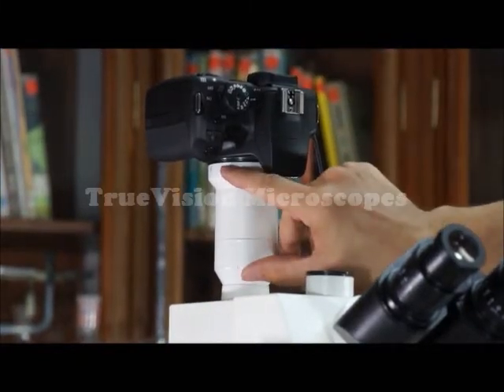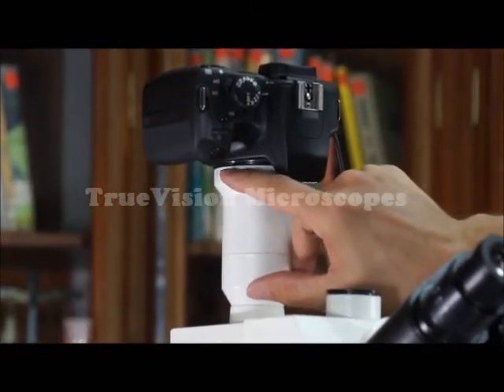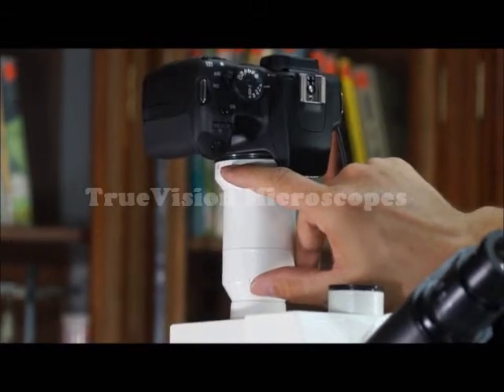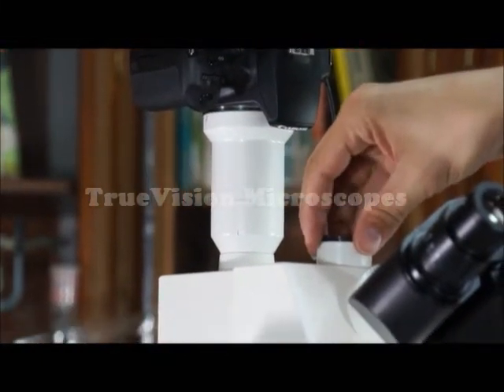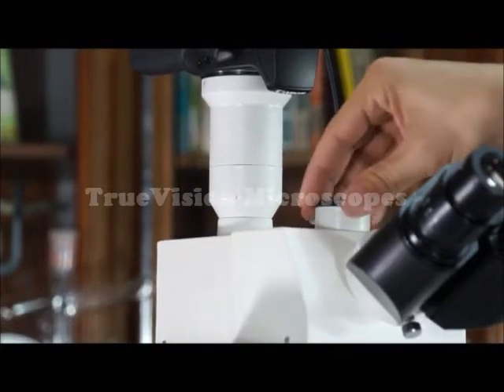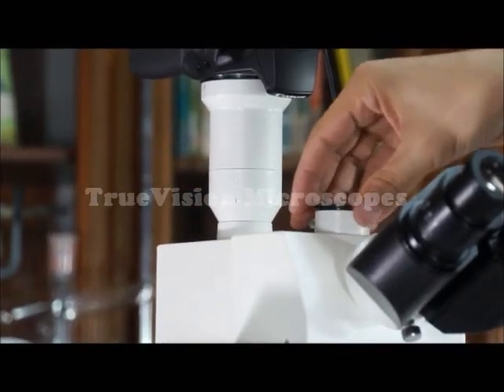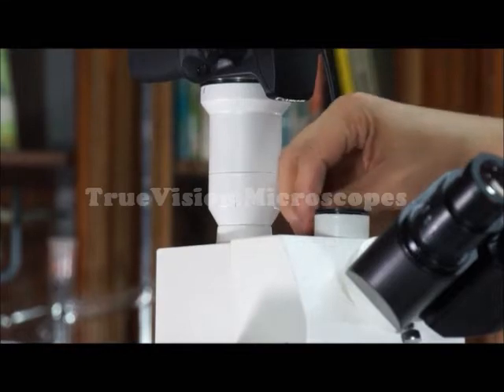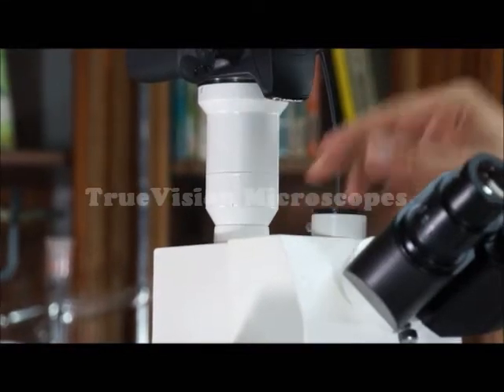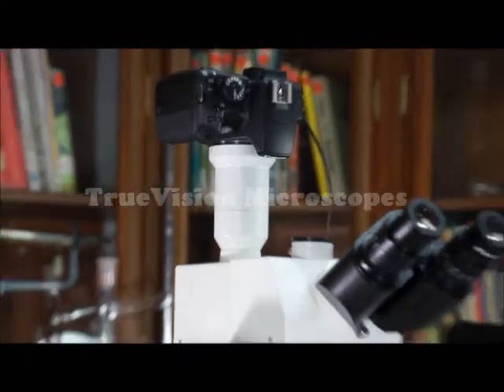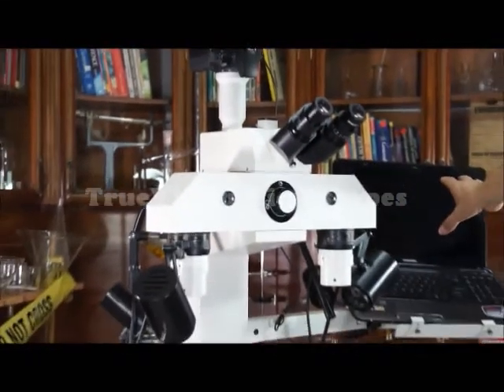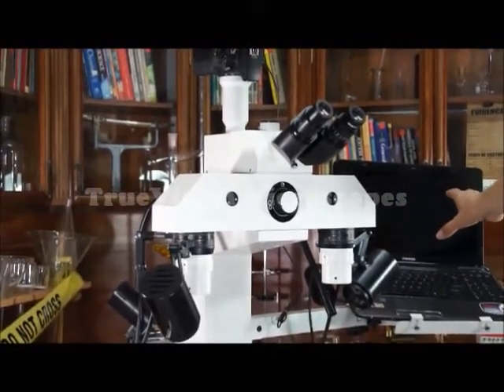We have an SLR attachment and we have a secondary photography port. This port would be for something like a video CCD camera. This digital SLR camera is connected into the laptop to take the digital video and digital still images.